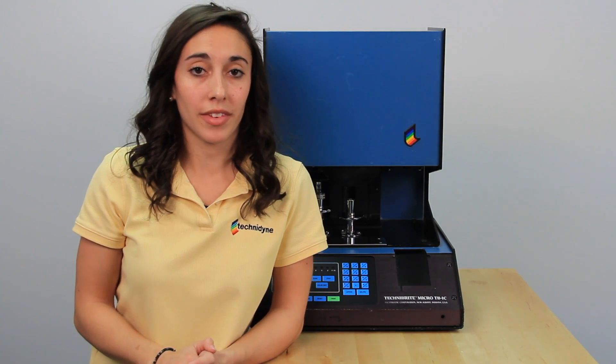Today we're going to talk about Technidyne's Micro TB-1C. Because the instruments need to warm up for about 30 minutes prior to any usage, I'm going to go ahead and show you everything that you'll need to have on hand in order to do your calibration.